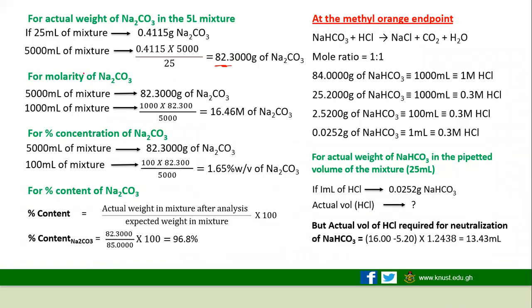Now, we are saying that we have to find the molarity. The molarity can be found in so many different ways. This is one method I will explain. The other method is that we have C is equal to n over V, which is equal to m over molar mass times V. Now, this m here is the mass in grams. The volume here is the volume in dm cubed or liters, right? And then the molar mass here is in gram per mole. So if you can convert all these, you can just find your concentration quickly.